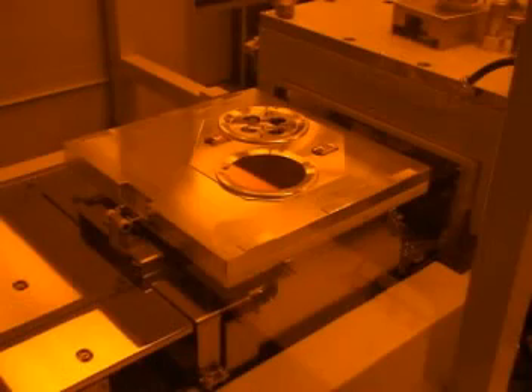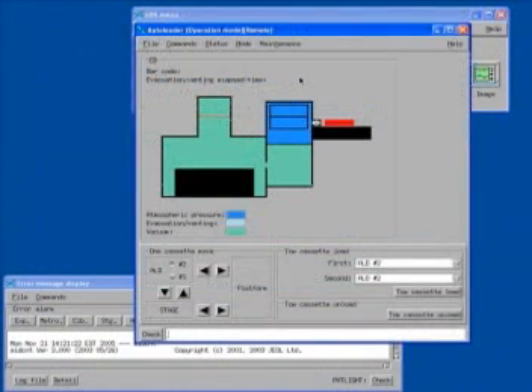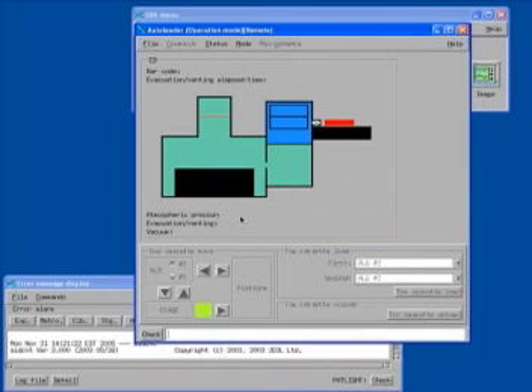Once you have placed the cassette onto the platform, you can load the cassette by performing the following steps at the UNIX workstation. You must first select the auto loader or ALD button from the EBX menu. The ALD graphical user interface or GUI should then appear. Select the left arrow button at the bottom of the GUI to send the cassette from the platform to the stage. The software should detect the presence of the cassette and will ask you to verify that you want to load it. Click the yes button.